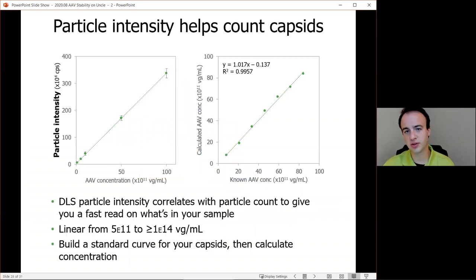And then by using our particle intensity from our DLS reads, we're able to help look at capsid titer as well. So particle intensity is going to be the light scattering intensity that comes off of an AAV sample and it's going to correlate linearly with concentration. So in this case, we're showing a sample where we've built a standard curve on the left and on the right, we've used that standard curve to take a look at different unknown concentrations of capsids and use this to calculate concentrations. So in this case, we have an R squared value of about 0.99 and we'd be pretty happy with this assay for using standard AAV capsids to build that standard curve and then use that standard curve to understand what our concentration of unknowns is.